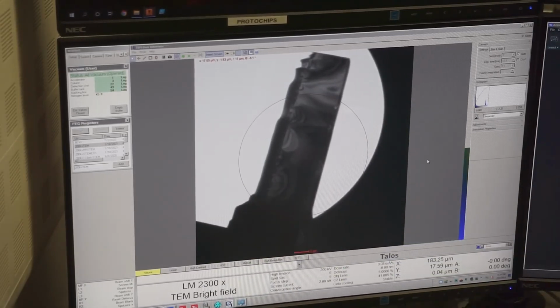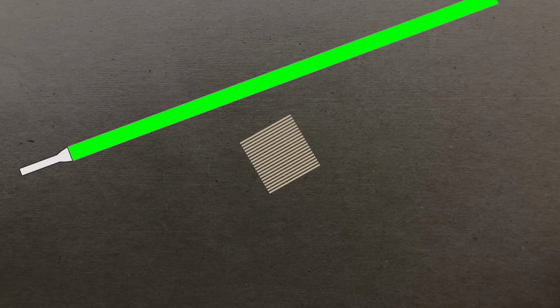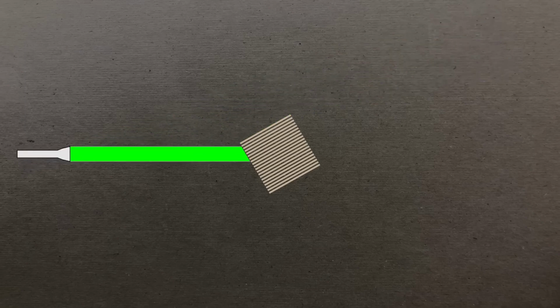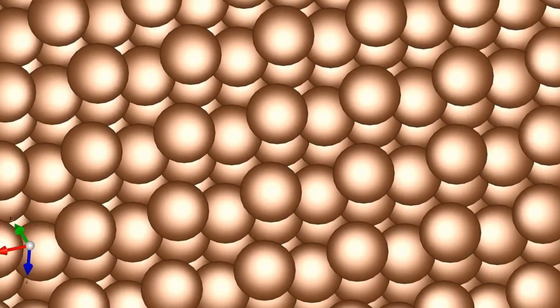It's really interesting. But right now, what we need to do is basically get the beam pointed at the sample and get the sample pointed at the beam. Getting the beam pointed at the sample sounds pretty straightforward, but getting the sample pointed at the beam, that's a weirder phrase. You need to remember that we're dealing with a crystal, this perfect 3D grid of atoms in space.